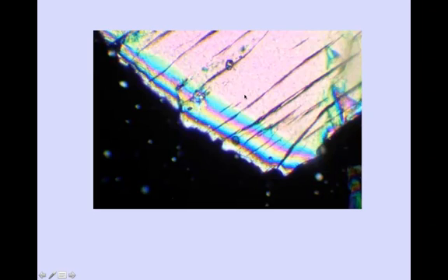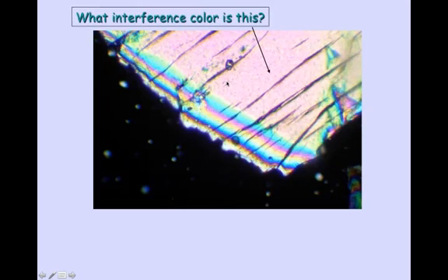What you're seeing are pastel colors on the top in third order, then bright colors in that spectrum in this next sequence of colors, and then they become more dull. You see the red, yellow, and then gray. What you're seeing is first order through to first order red, second order, and third order. So you're looking at third order red.